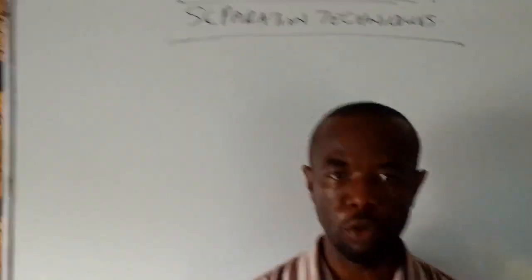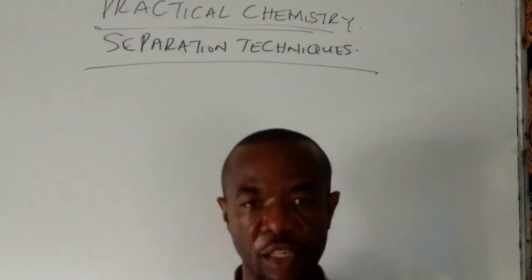Today we are on the chemistry content, tutorial or practical, and today we are going to look at separation techniques, a topic meant for those in SS1, high school 1 or senior secondary school 1, and also useful for people in SS2, SS3 who don't have an idea of how to carry out separation techniques. So our focus today will be on separation of a mixture by the method of filtration.